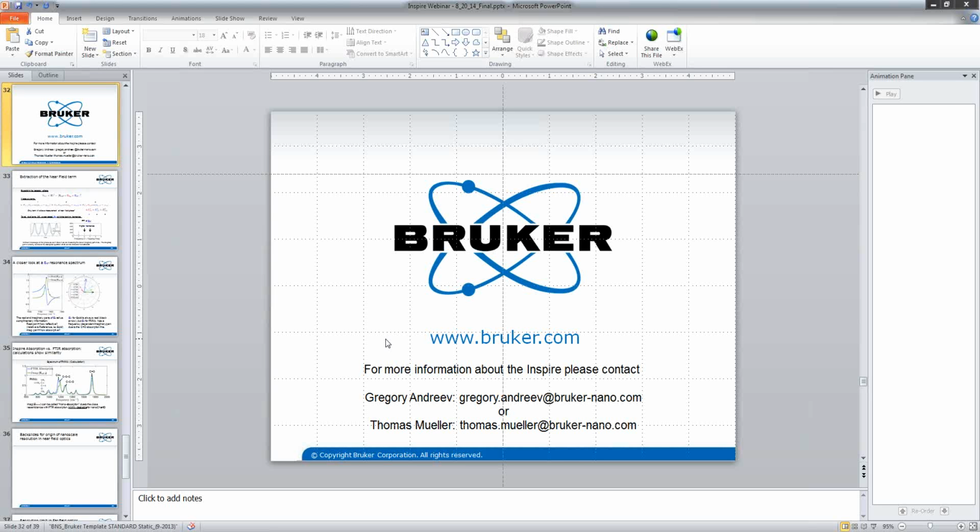And these tips are already commercially available. They're not expensive. They're also compatible with PeakForce Tapping and PeakForce KPFM and other electrical modes. So that's the nice thing about having a conducting tip, is you can already perform electrical measurements without having to switch tips. In fact, SPIR, PeakForce Tapping, and PeakForce KPFM can all be performed simultaneously.